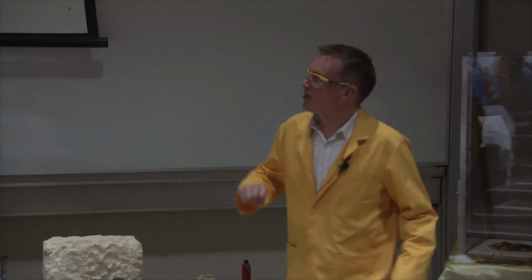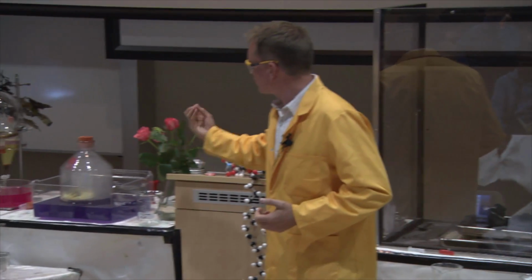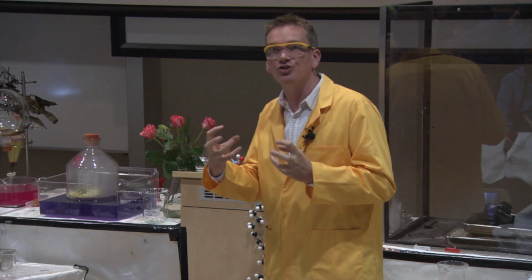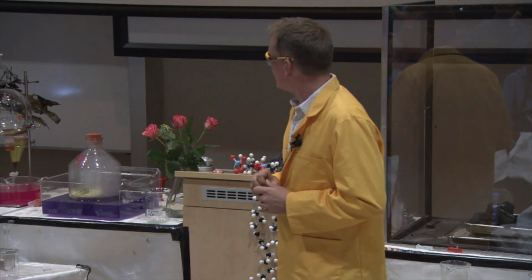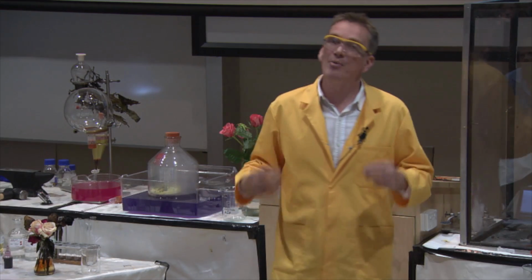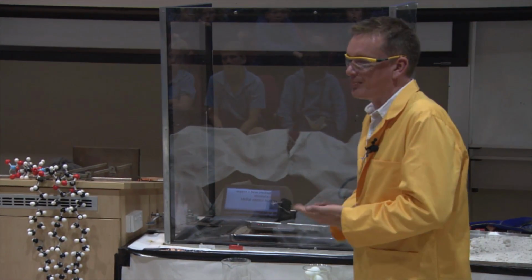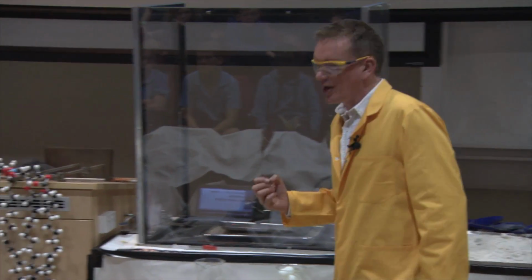Now, once we've got the rose there, by the way, I'm hoping that you may see a change take place, because any sulfur dioxide that comes out here may react with the rose, and it can break down the structure of those pigments that colour the rose, so it might actually bleach it. And also the water here, the purple cabbage, it reacts with acid, and we get a red colour if there's any acid there. So keep an eye on it. We'll see what happens. Right, now, having got my acid, I can do things with this.